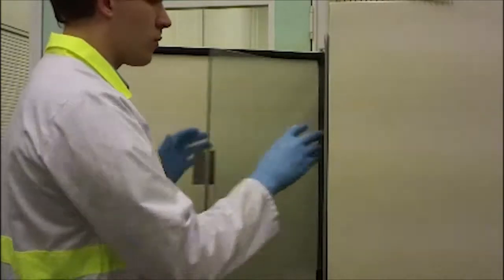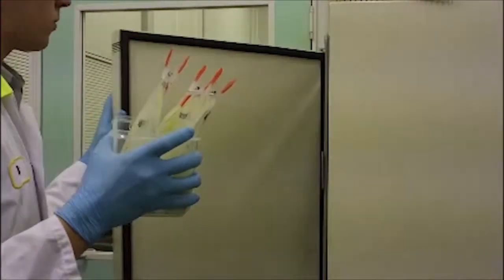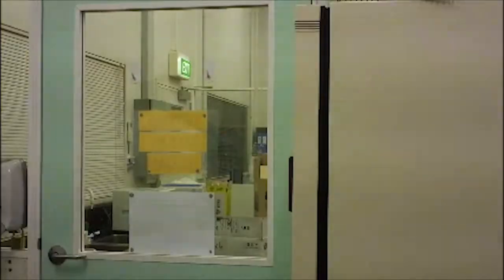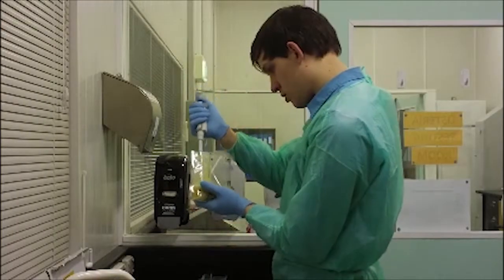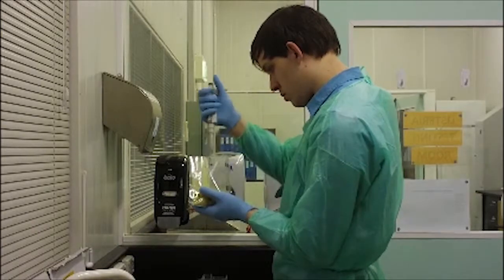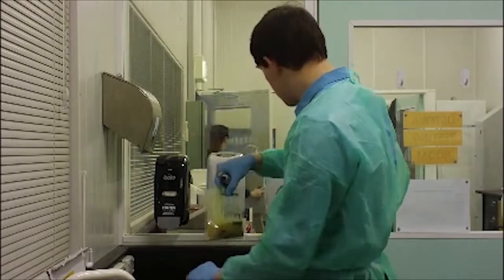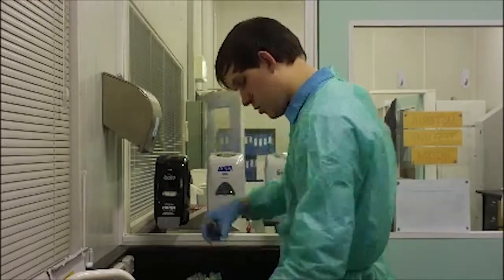After the relevant incubation period has passed, I remove my samples from the incubator and begin my final steps of sample preparation and extraction. This involves me taking a 500 microliter aliquot out of a filter in the sample bag, and then I add this to an ELISA strip which is read by an automated machine.